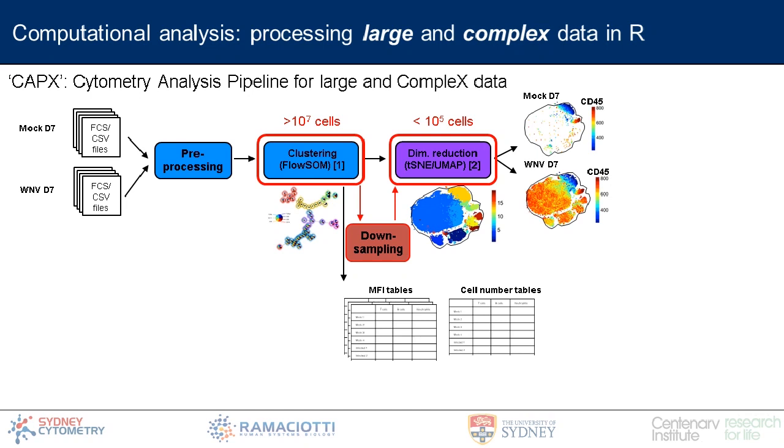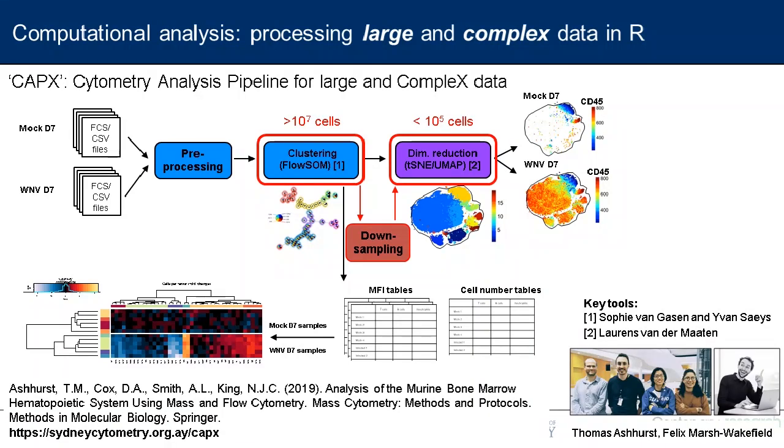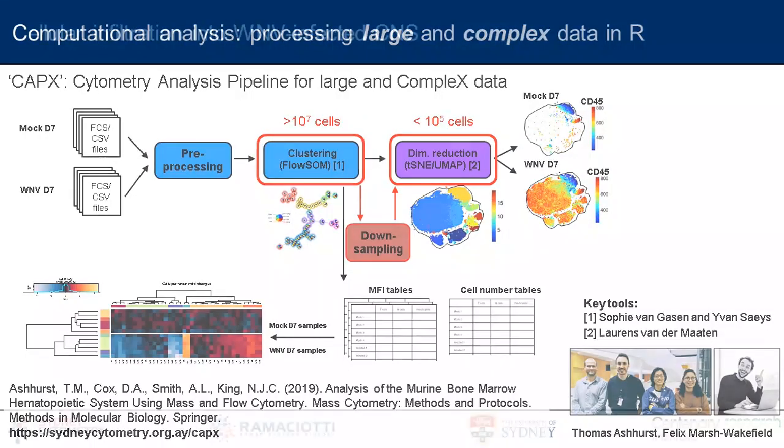So when we go to create our summary data, we go to do our cell counts and our frequencies, this comes from the very large data set, which gives us more robustness when we're doing our statistical analysis. And this then allows us to create our graphs, our heat maps from a more significant size data set. And so what this does is give us a sort of practical, real-world way of getting around these size limitations, which for us is very helpful. And so this is all part of that sort of spectra workflow that I talked about, but this can be reproduced in pretty much any tool that's out there at the moment.